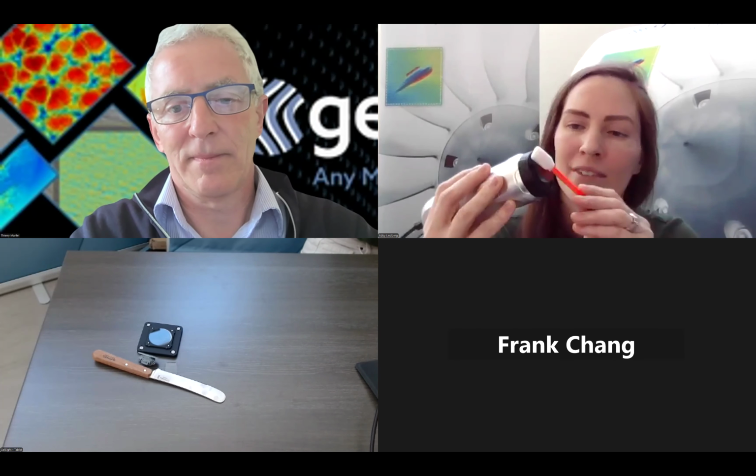So for this one, we do have a few different gel formulations. I mentioned the toothpaste one specifically, we used a silicone gel for. But application dependent, we can pick whatever gel makes the most sense for your application. The gel that I'm using today has a low friction coating on it, and we just clean it with a dry foam swab. This might not be the gel we'd recommend for that, but some of the other gels we just clean with blue painter's tape or even water.